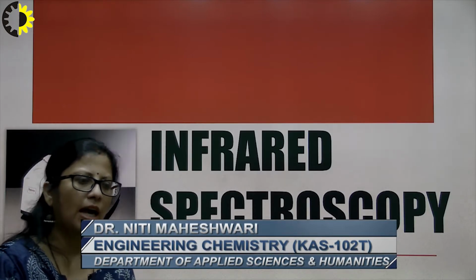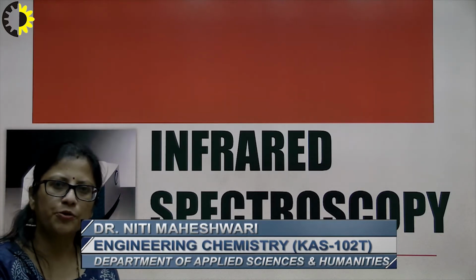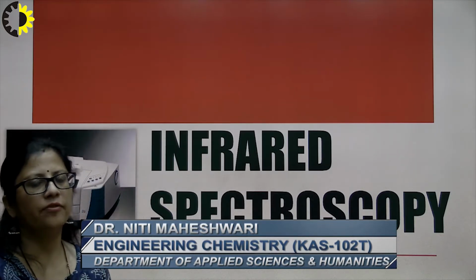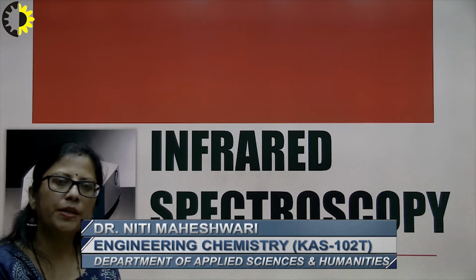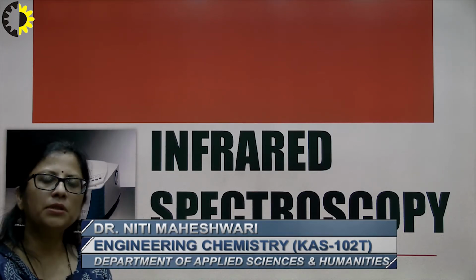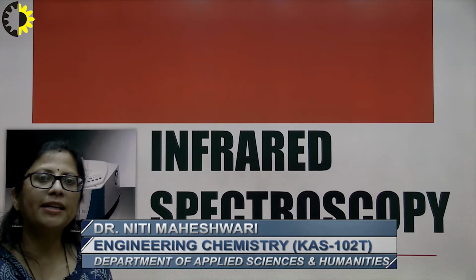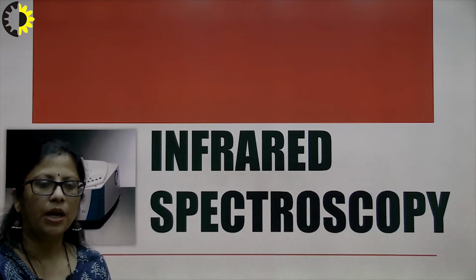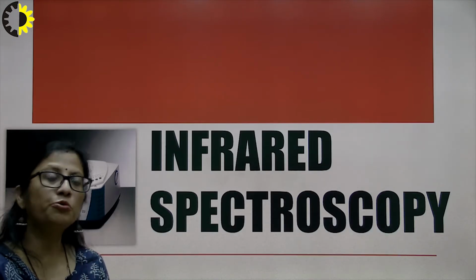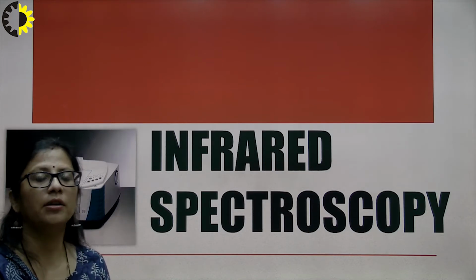Now today I will be taking the second topic of spectroscopy, that is IR spectroscopy, also known as infrared spectroscopy. This spectroscopy is used for finding out the structure of a new compound or to identify the structure of two compounds. A new compound can be identified, or two different compounds can be identified whether they are same or they are different.